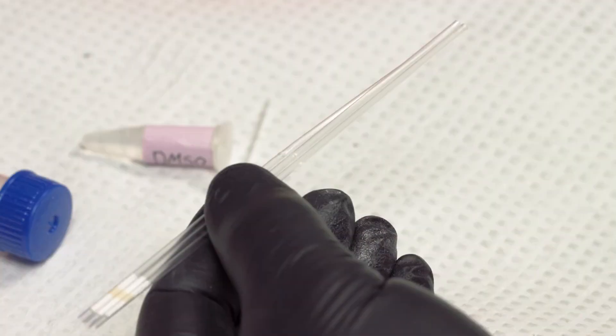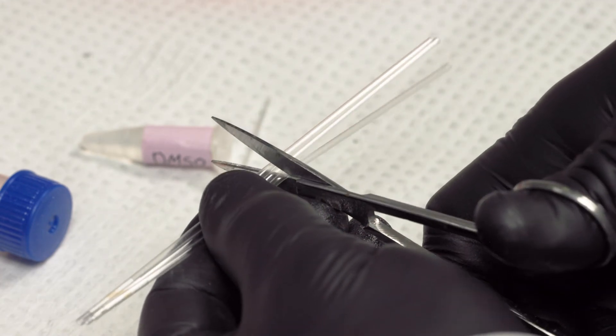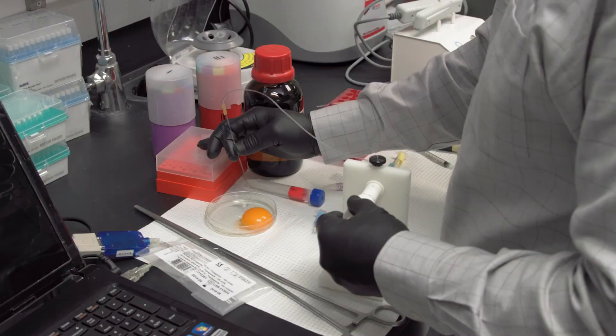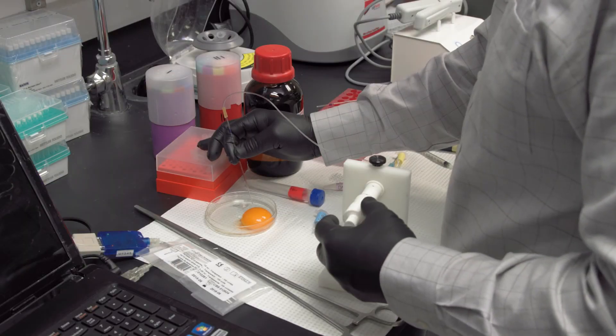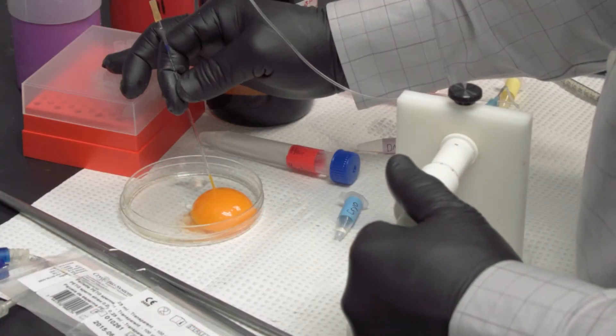We utilize 1/4 cc or 250 µL cryostraws, which are cut to a length of about 6 cm. We generally freeze in 20 µL volumes, but this can be adjusted depending on the purpose of the cryopreservation program.